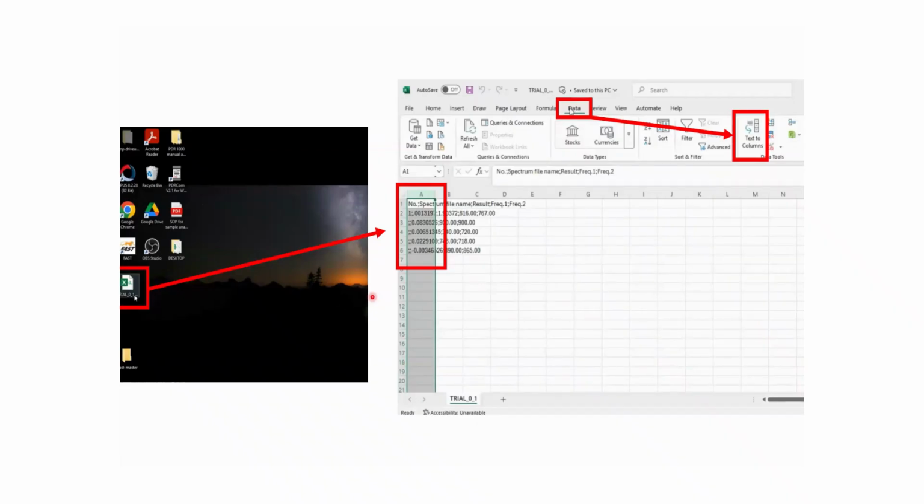So now we need to go find that CSV file and do a little editing. And since I generated the report to the desktop, we'll see that here. So all these are just in a single column. Here they need to be spread out until they are each individual cells.